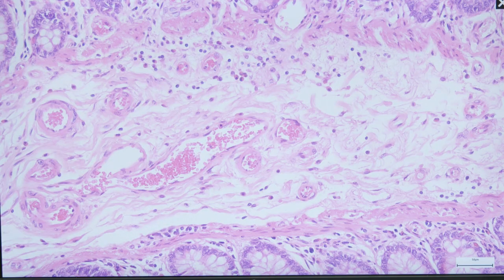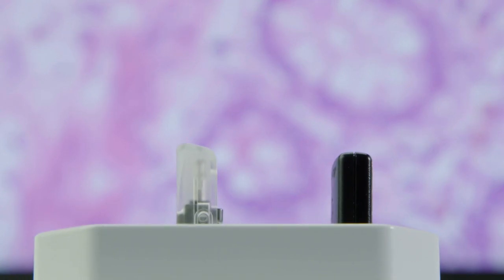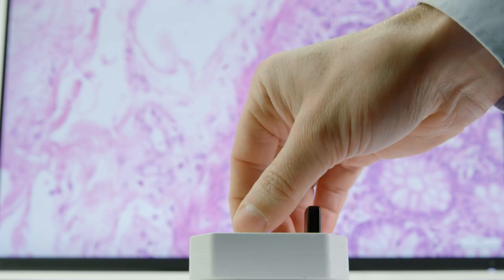Your bright-field image as it appears through the eyepieces, including the right scale bar, is ready and waiting on your USB stick.